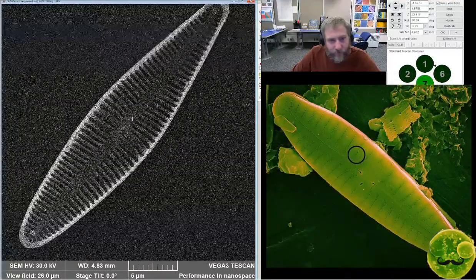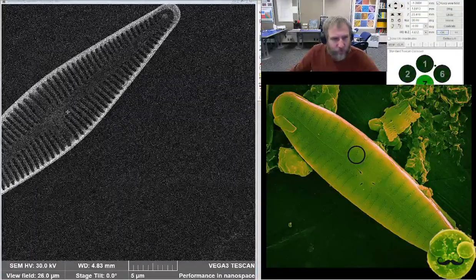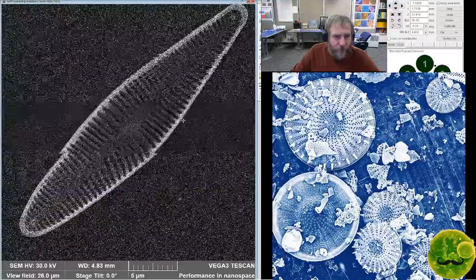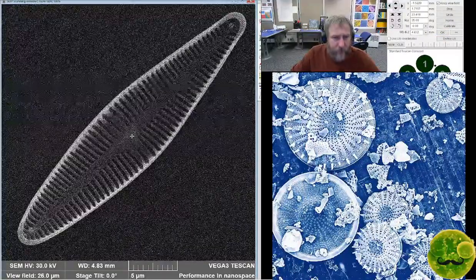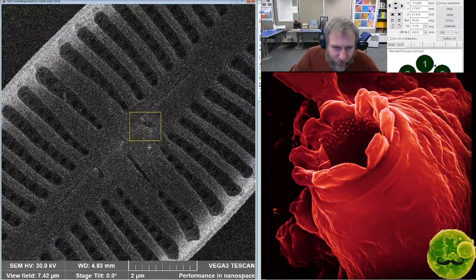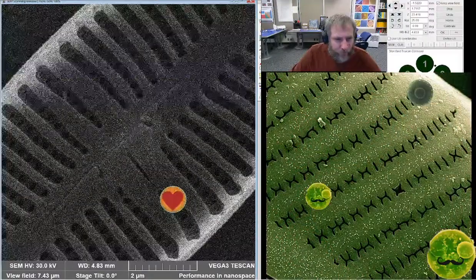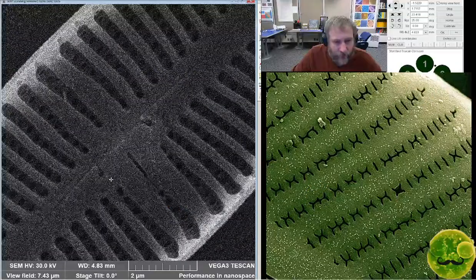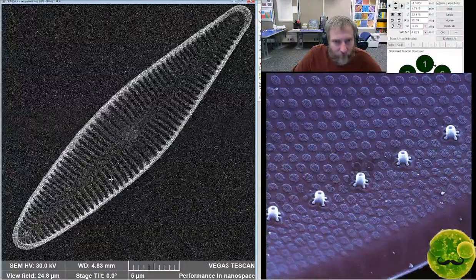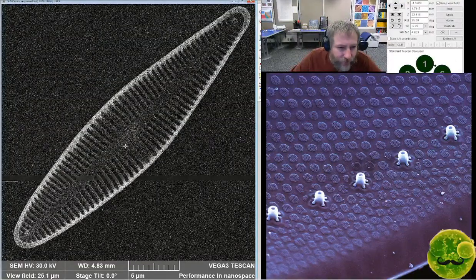Trying to figure out what this diatom is. Sort of one of my missions for the day. I thought maybe it was Afrocymbella, but it does not appear to be. Connected with the intermissio the way they normally are. Normally there's like an arc right here. And so I think it's actually just a Gomphonema. But I'm gonna get some good pictures, and then Itzi and I will have a discussion about it.